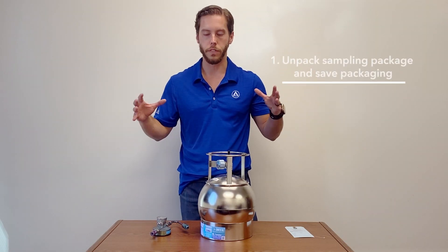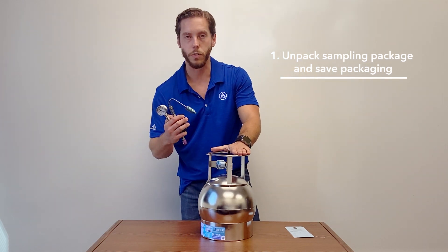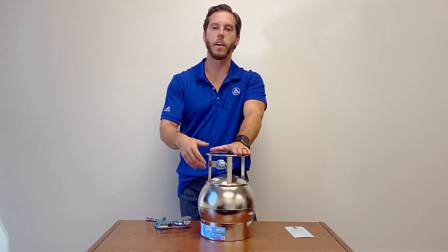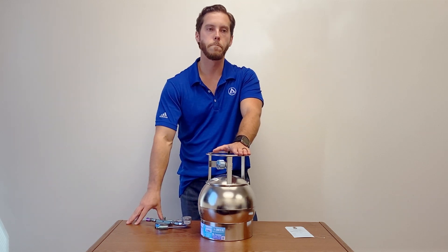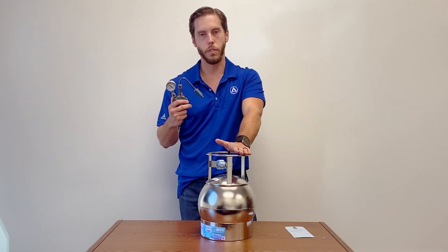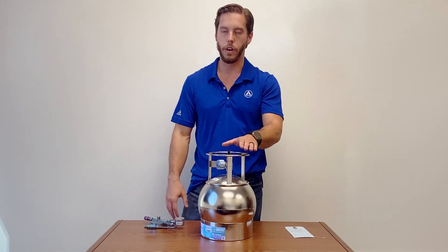The first thing you're going to do is receive everything in a package. This is the canister, this is the flow controller. Once you remove everything from the packaging, save it all because you're going to have to send it back to us. Everything's pre-calibrated based on your time duration needs — for the most part these are calibrated to 24 or 8 hours. Everything's leak-checked beforehand so you don't need to play around with anything.